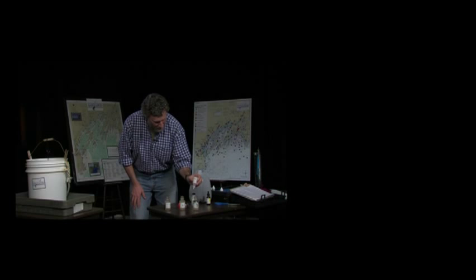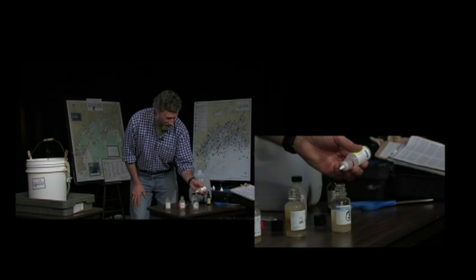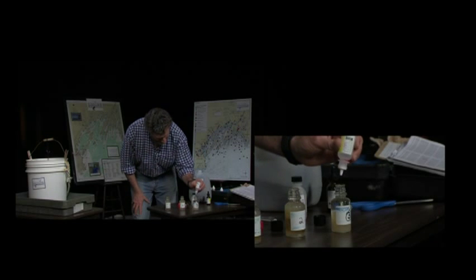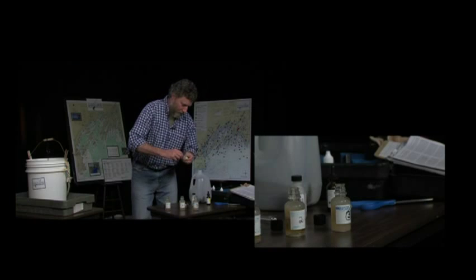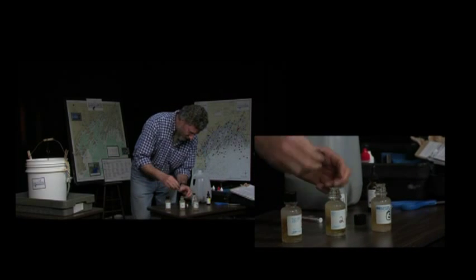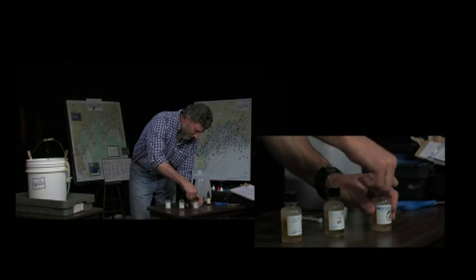And you notice that I'm keeping the bottle vertical. If I were to have my dropper on its side like this and add the drops, you tend to get a smaller droplet than you would if it was totally vertical, and we want to make sure that they're all the same. And we'll put that away. We'll put the caps back on. You notice it's already started to turn a little bit of a yellowish hue to it.